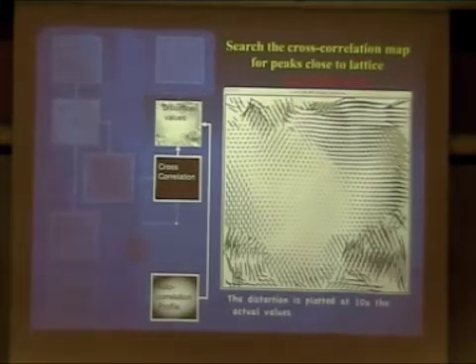If you would have a shift of half a unit cell, which happens quite frequently, would you pick it up properly? I don't think so. If it suddenly shifted by half a unit cell, it won't. But if it's a gradual change over several unit cells, then it will be able to. Right. But this is one of the difficulties we often have. Two lattices are perfect, but it happens that there is a crack and they are shifted by half.